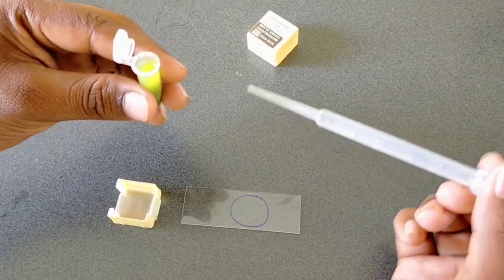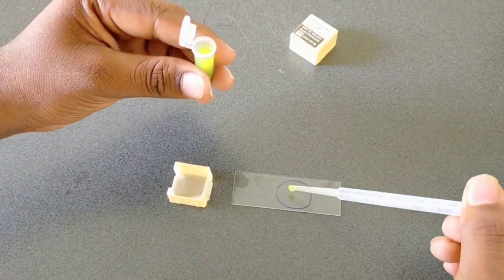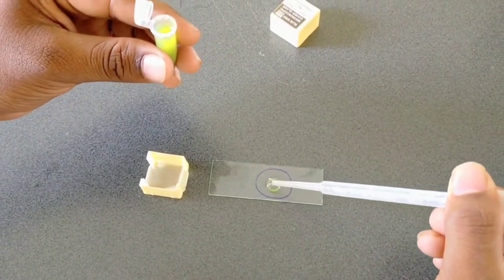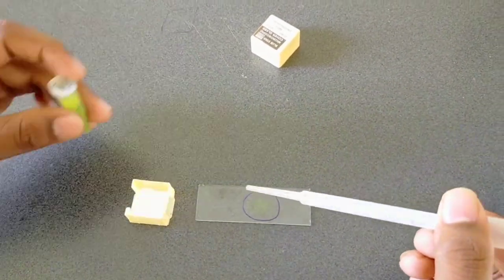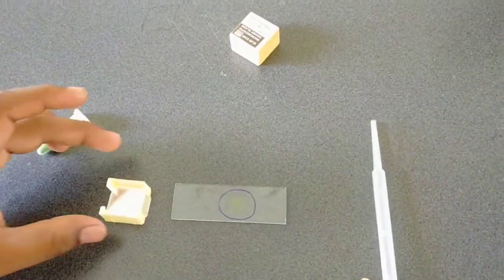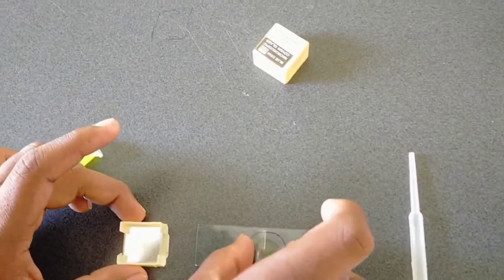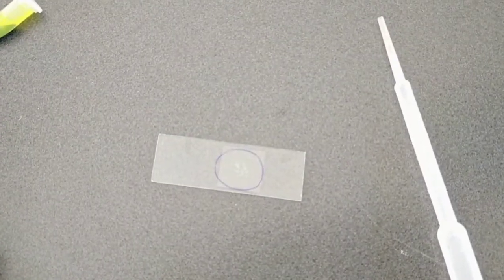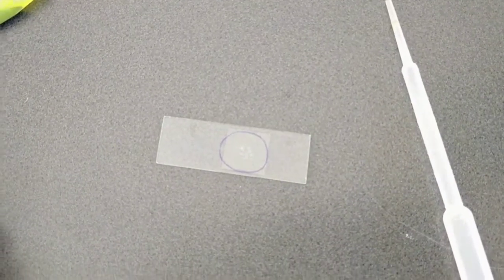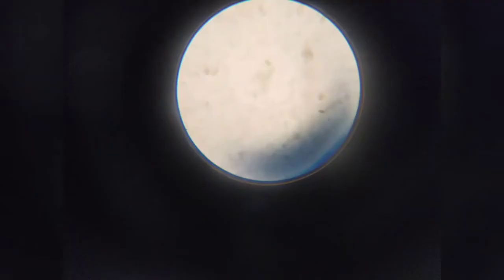Add a drop of supernatant on the marked place on the slide. And gently cover it with cover slip. And focus it under the microscope. The isolated protoplast is seen under the microscope.